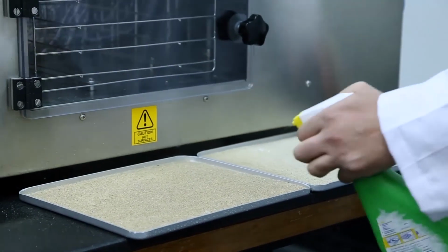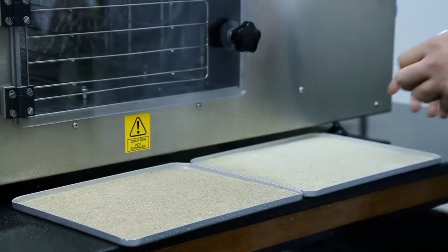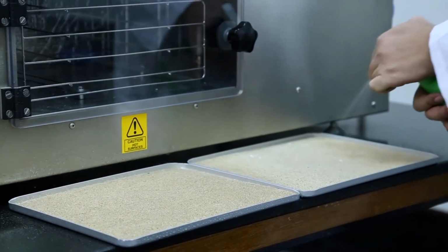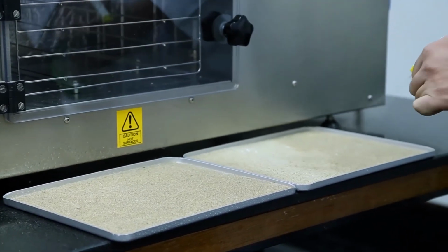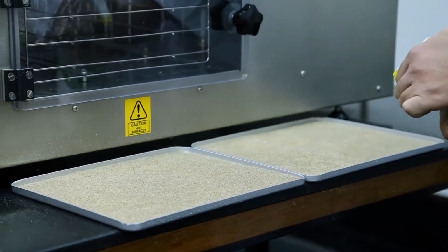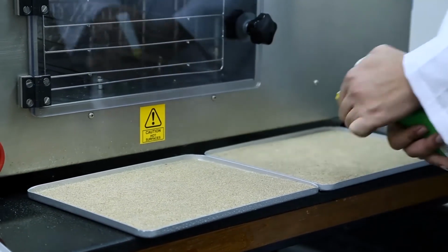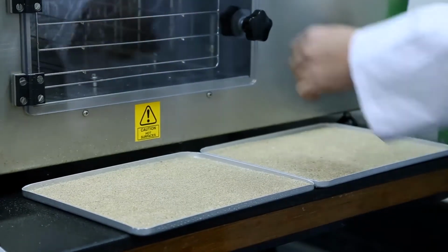Okay. Also here, so now the surface is totally wet.